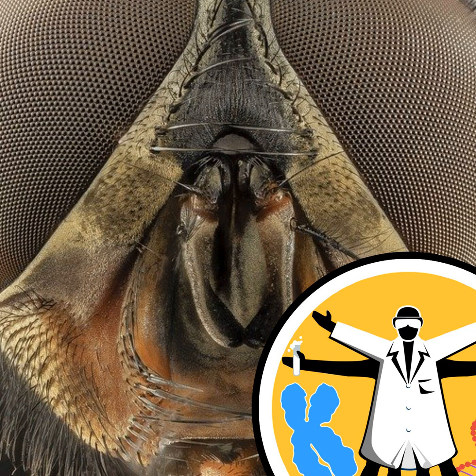So we're going to try two different experiments with these flies. I think with some of them what we'll try doing is just mashing up the entire fly. Then we'll get all of the fly DNA and all of the bacteria that's in the fly. So on the outside of the fly, on the inside of the fly, in its mouth parts, in its stomach. You're going to get a lot of fly. We're going to get an awful lot of fly. And also, bear in mind, the fly and the bacteria will be mixed all up together. So this would be whole metagenomic sequencing.